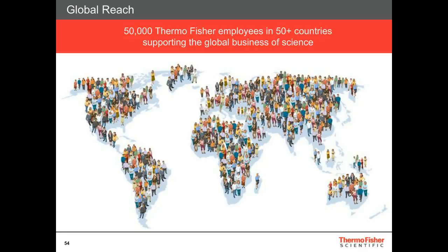Could you tell me which instrument is more sensitive, the triple quadrupole or the HRAM? In this presentation we were talking about methods for 2 triple quadrupoles, TSQ Endura and TSQ Quantiva, which is a high-end instrument, and high-resolution accurate mass spectrometers, QExactive Focus and QExactive. If I compare TSQ Endura, triple quadrupole, and QExactive Focus or QExactive, the sensitivity is comparable. TSQ Quantiva is a little bit more sensitive, roughly 10 times more sensitive than TSQ Endura. I hope that I've answered the question correctly.